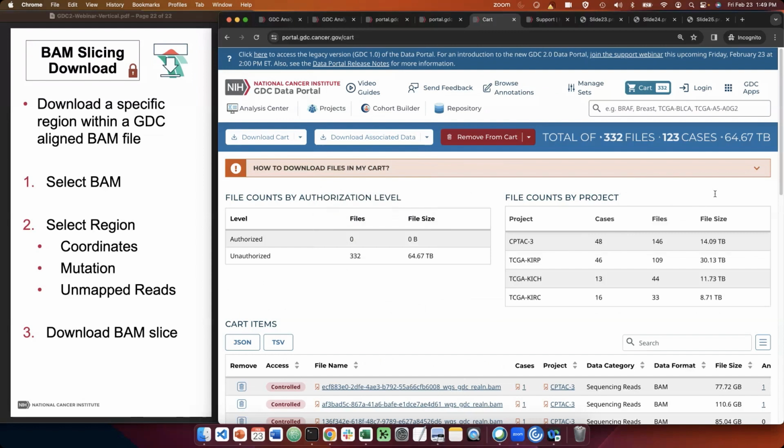I see another question. I'd like to ask if it's possible to change settings for building a clustergram for gene expression analysis, as an example, the distance among samples or the linkage. So I don't think the gene analysis tool does that yet. We can definitely pass that on to the group that develops the gene expression tool. But for now, it only visualizes the most commonly expressed genes versus the cases and plots a matrix accordingly.